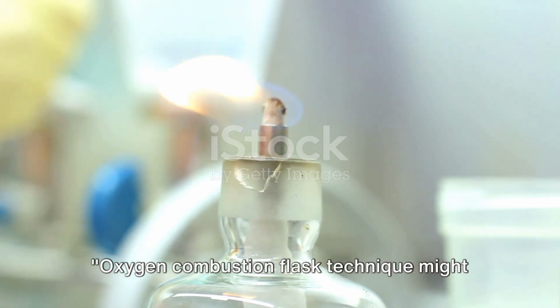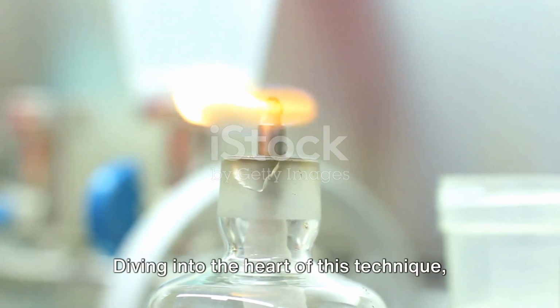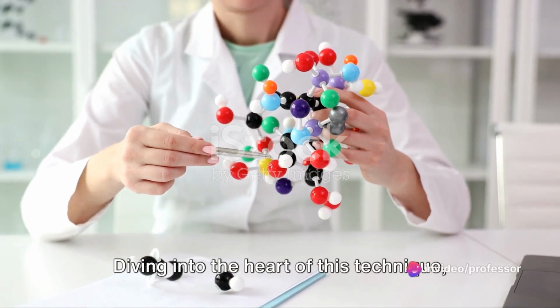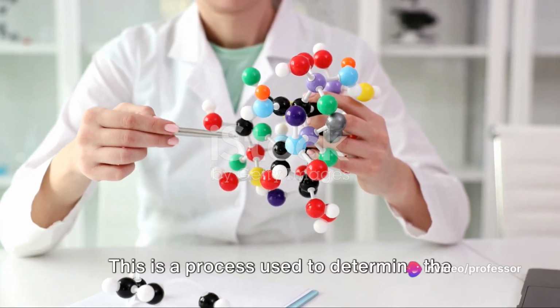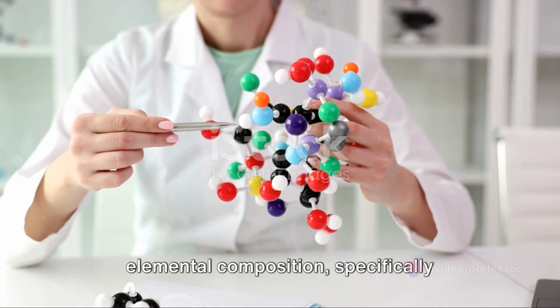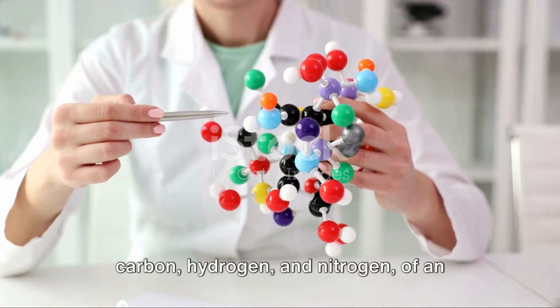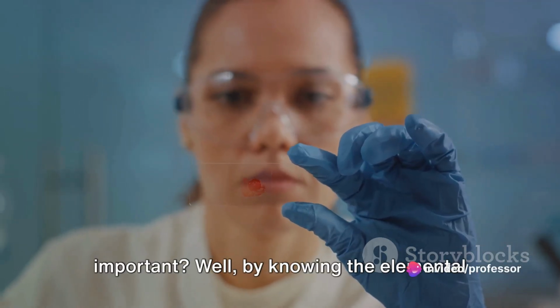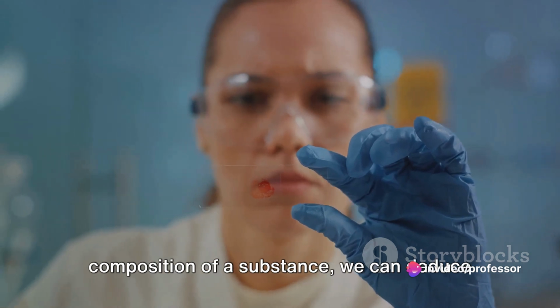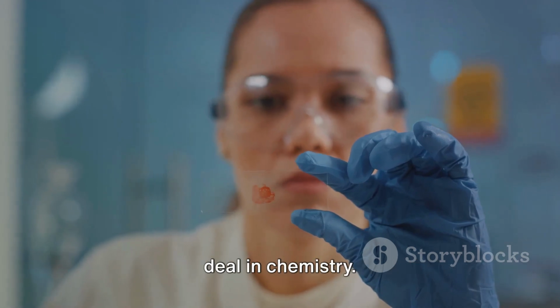Oxygen combustion flask technique might sound like a mouthful, but it's a crucial method in chemistry. Diving into the heart of this technique, it's all about one thing: combustion analysis. This is a process used to determine the elemental composition, specifically carbon, hydrogen, and nitrogen, of an unknown substance. Now you might ask, why is that important? Well, by knowing the elemental composition of a substance, we can deduce its molecular structure, which is a big deal in chemistry. Let's break down how it works.